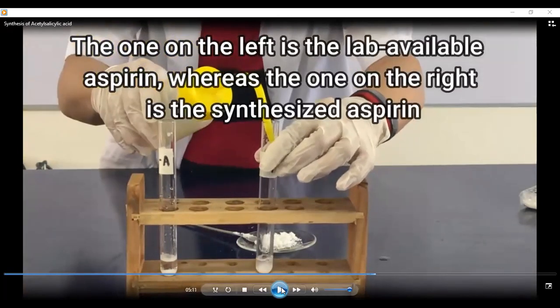So what I did first was to make a solution. Make a solution of the product or the lab available aspirin before adding the ferric chloride. In making a solution, it's really just an estimate. Anyway, it's just a chemical test. So just add enough water and enough powder.